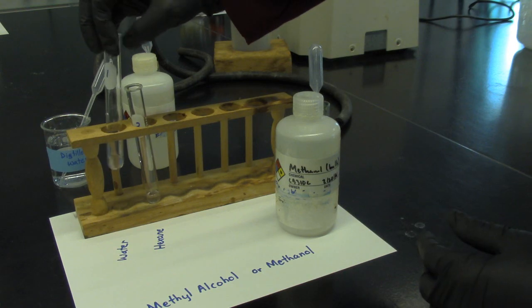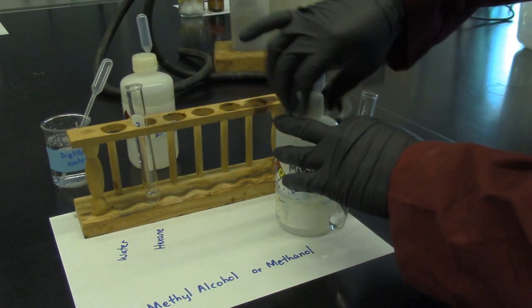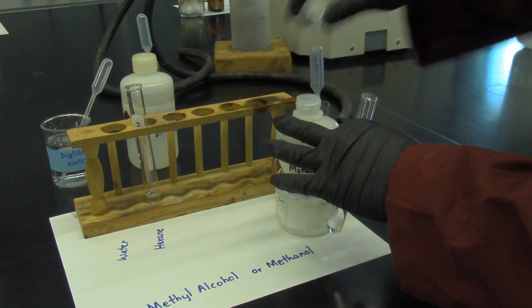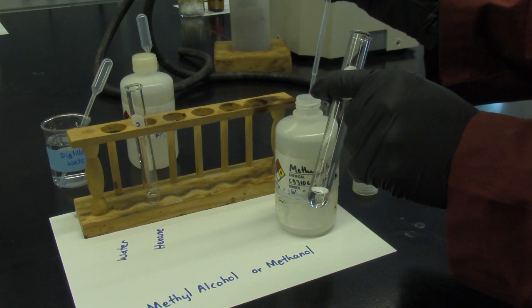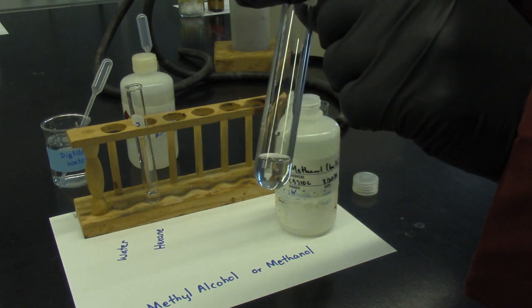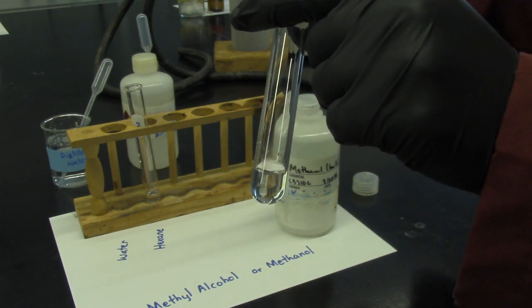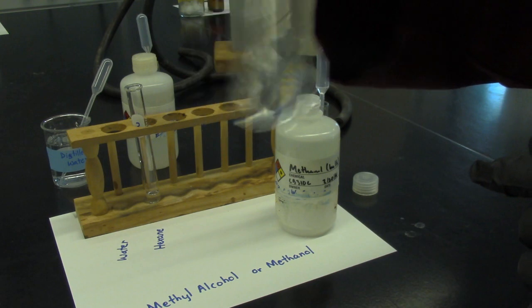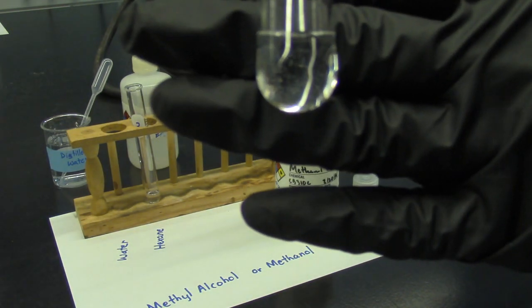First test tube, we have 1 ml of water. Then add a few drops of methanol, 1, 2, 3, 4, and I'm going to shake it and write down the observation.